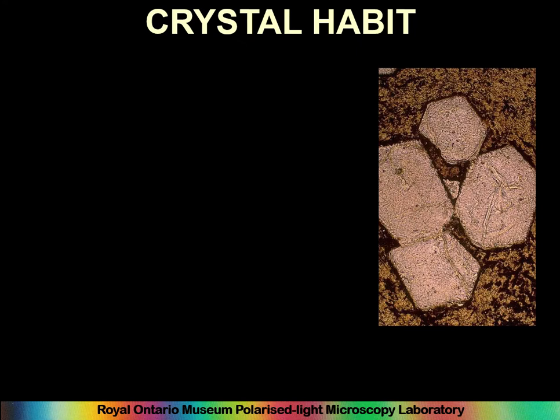So crystal habit is important. It's really important to understand minerals, but it's mostly important for description, because the most important thing to do is to describe what you're seeing. It's more important to describe it than to actually identify a mineral, because if you identify a mineral and you're wrong, then you have identified a mineral wrong.